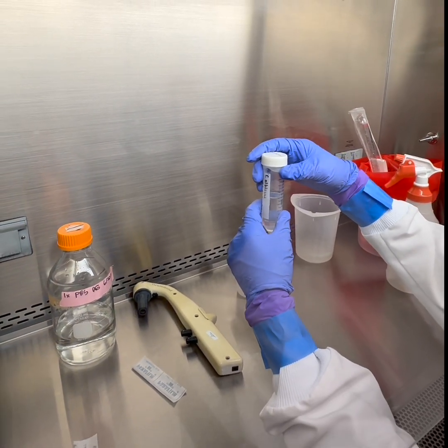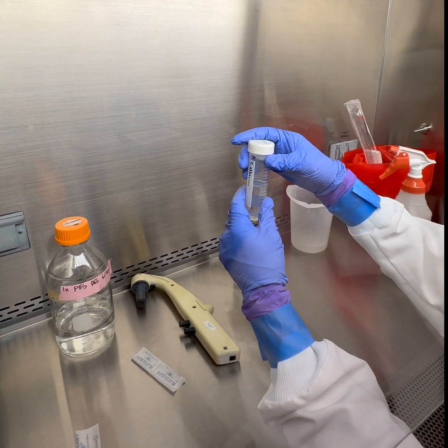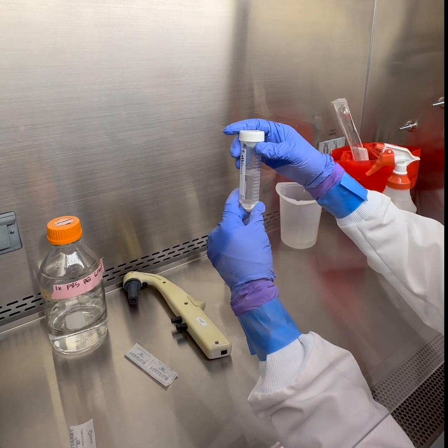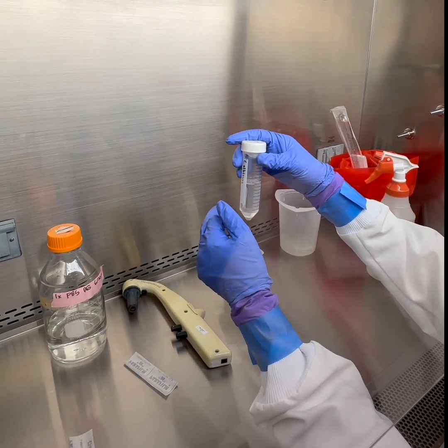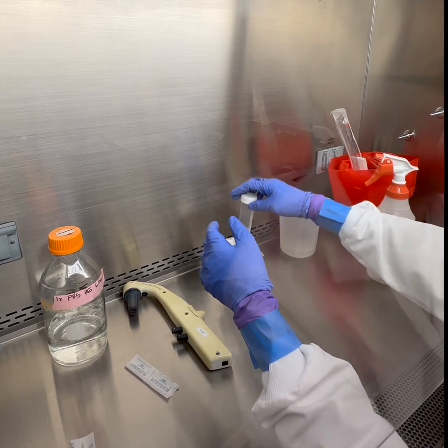This step simply consists of centrifugation and then decanting twice. And then we're going to resuspend it in RPMI 1640 media and plate it at the desired concentration, which is 1 times 10 to the 6th cells per milliliter.